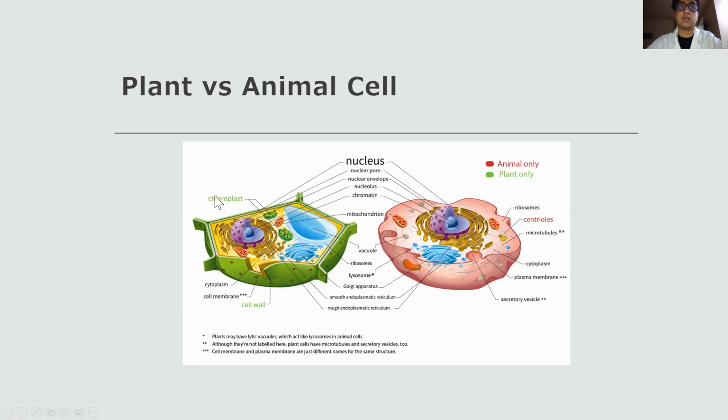And we also have the chloroplast. So like we said, the cell wall gives a structure, but what about the chloroplast? The chloroplast, as you may recall, is where photosynthesis actually takes place. So chloroplasts absorb sunlight and use it in conjunction with water and carbon dioxide gas to produce food for the plant, right? Chloroplasts capture the light energy from the sun, produce a lot of things, and you have this photosynthesis. And then once again, the cell wall provides that protection, gives it this rigidity. Sorry, I've been hovering over the bottom, but the cell wall gives this rigidity.